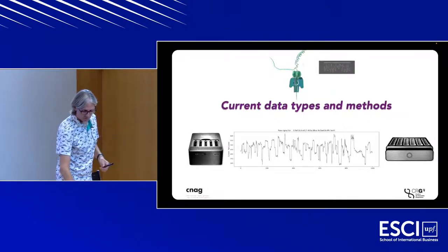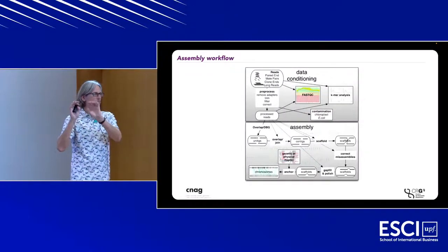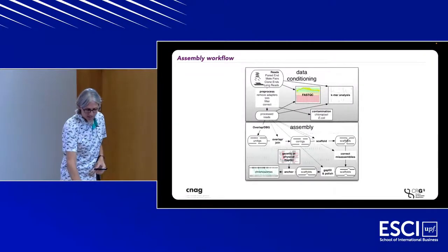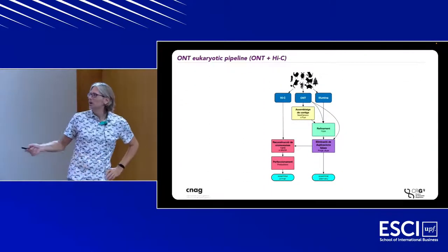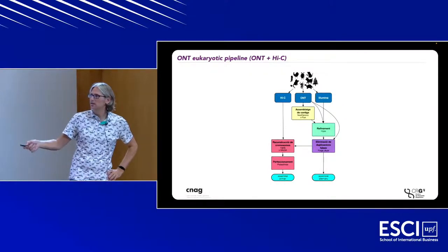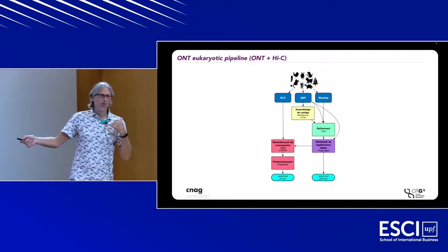We're doing pretty well. I'm going to wrap up the assembly part here with some real, like, these are the programs we use, these are the pipelines we use, okay? This is a schematic of a pipeline. This is more true to what we do. This is kind of our general recipe. And this figure is from a review that we did in Catalan. And we're trying to come up with the words for the different processes.